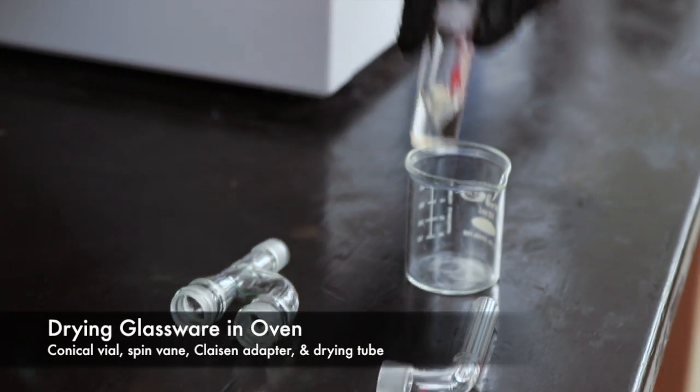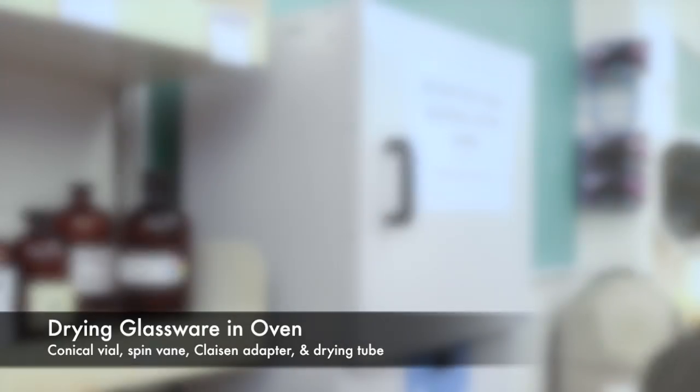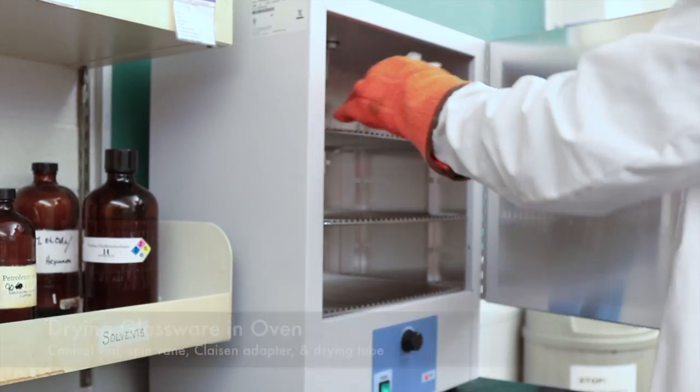I'm going to put all of the glassware in the oven. This includes the conical vial with a spin vane, the Claisen adapter, and the drying tube. And we'll leave them in there for about 10 minutes just to make sure everything is dry.